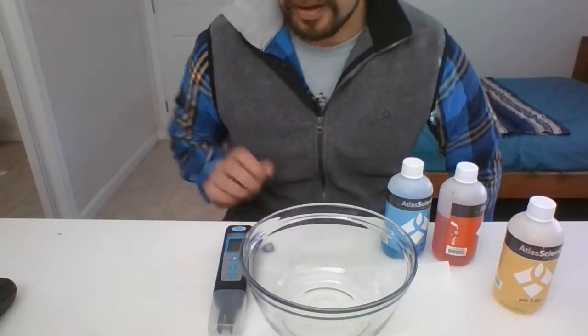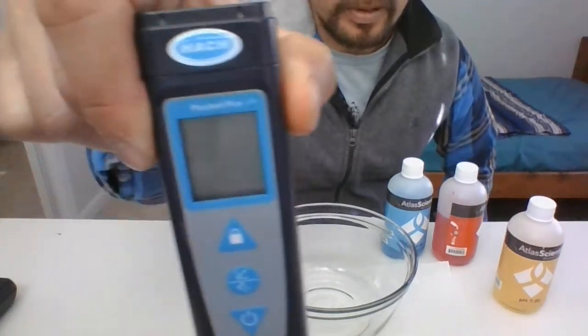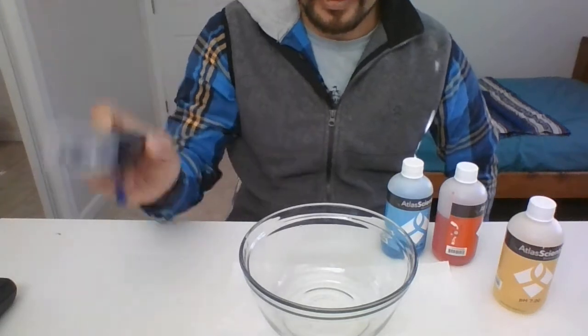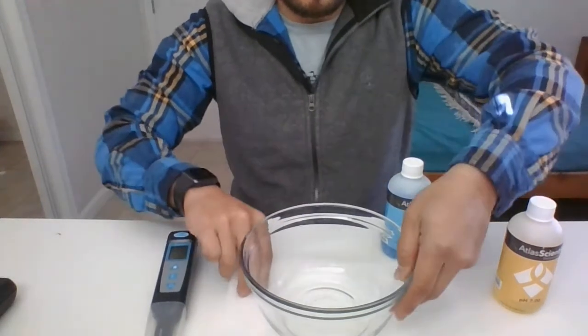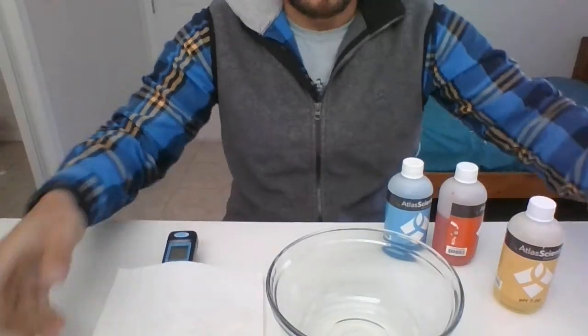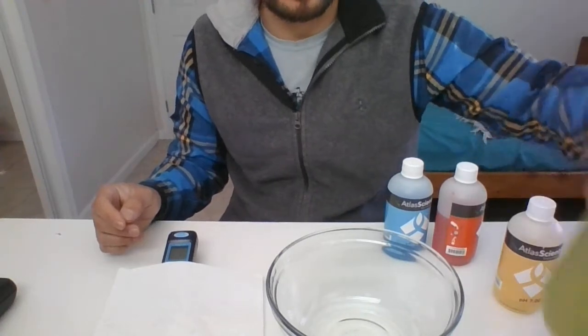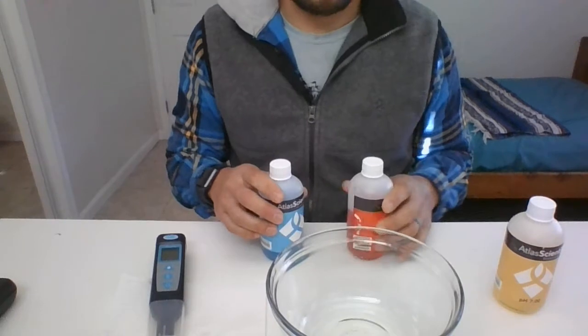We're going to calibrate our Hatch pH reader Pocket Pro. In order to do that, make sure you have your reader, a bowl, paper towels, some DI water or tap water to clean your reader, and your buffer solutions.